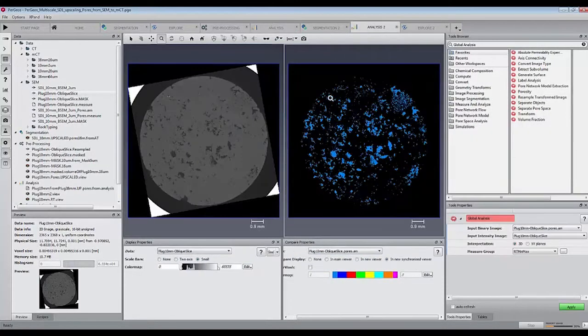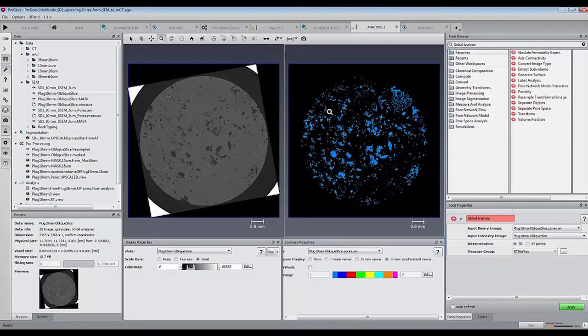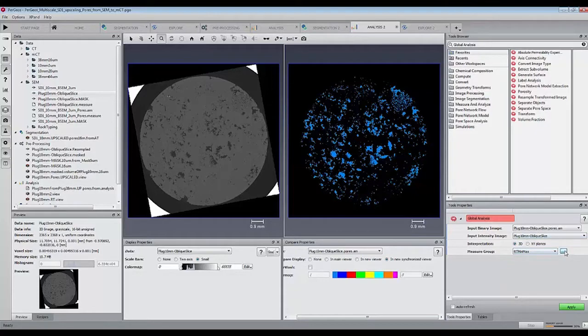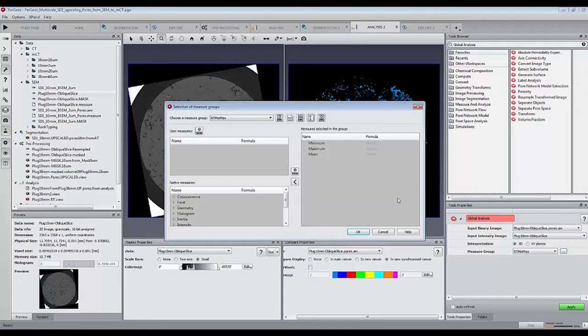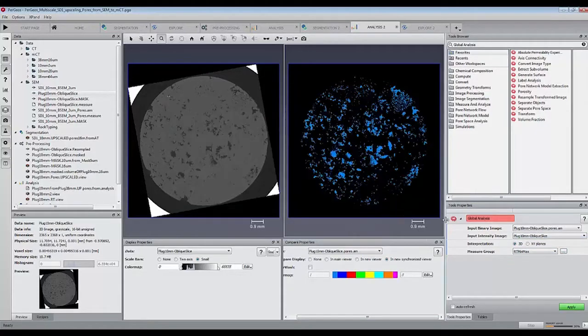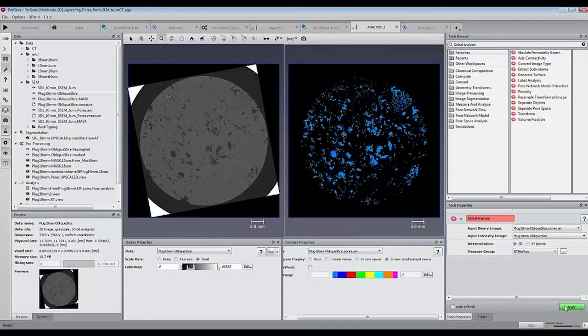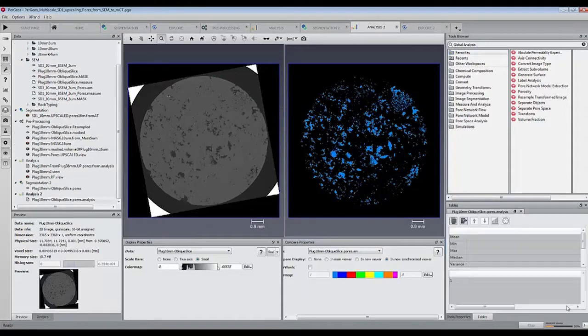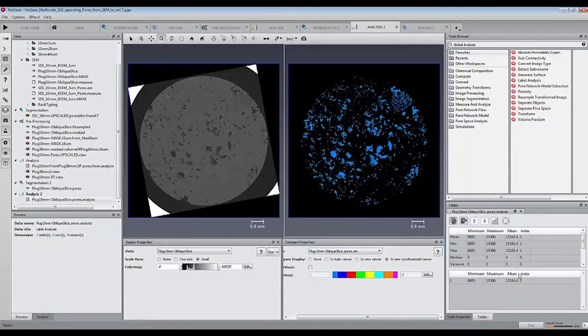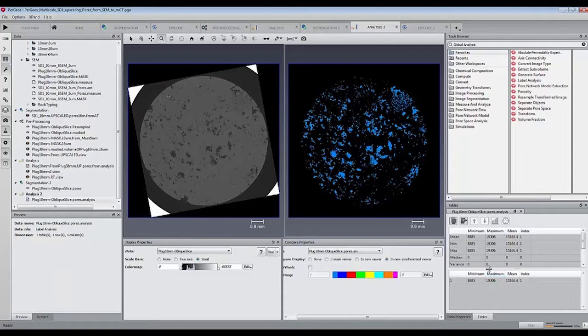Once the adaptive thresholding has been applied, we run a global analysis on the pore space to look at the maximum threshold value. We see that the thresholding was 19,306 as the upper limit will give the equivalent porosity of 10.36%.